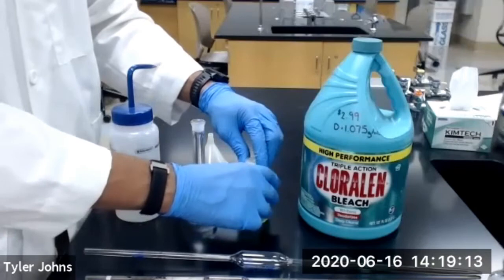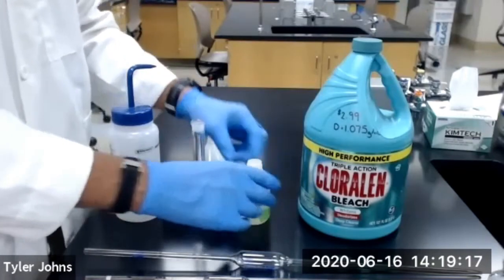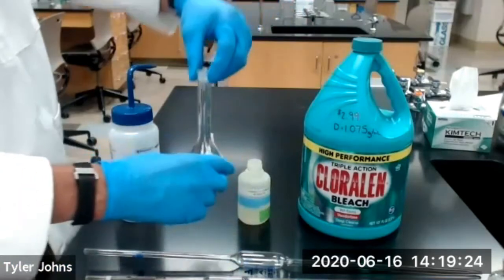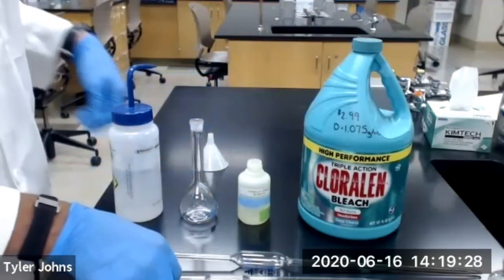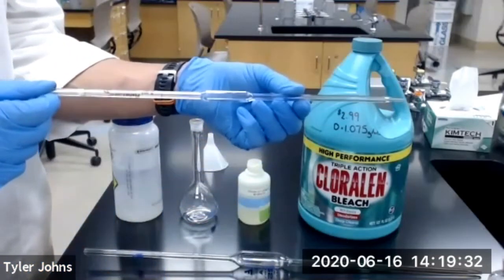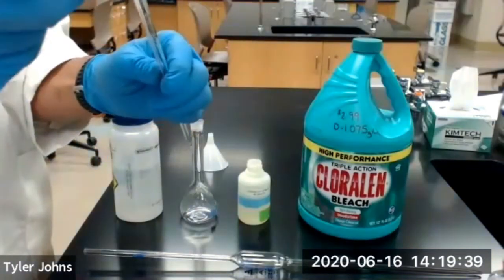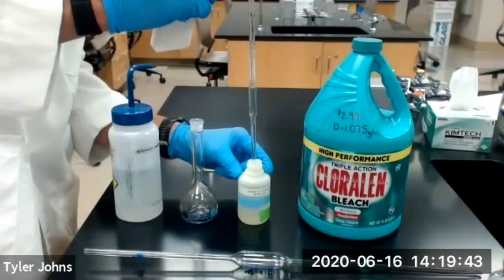We're now going to pipette 5 milliliters of our commercial bleaching solution to a 100 milliliter volumetric flask. This is our 100 milliliter volumetric flask. We're going to do this using an analytical pipette or a volumetric pipette. This is our 5 milliliter volumetric pipette. So we will fill to the mark on the pipette with commercial bleaching solution.